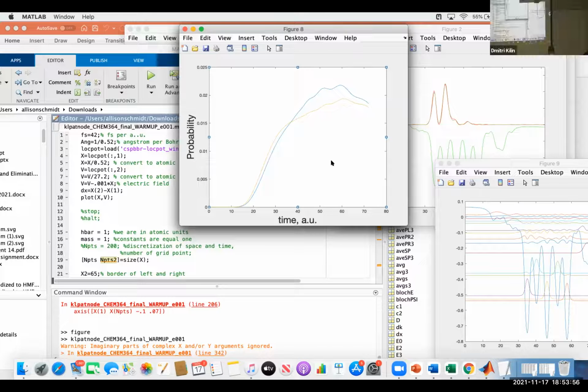Not all of these figures will go into your final report, but they will be the body of your scientific research. What do we expect to see? As you increase the field, the blue line will grow more and more vivid. Right now it reaches the value 0.02. As you increase the field, it is expected to reach values like 0.03, 0.05.